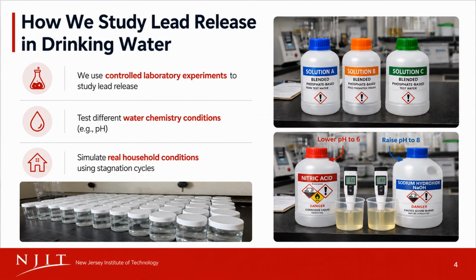In this study, we set up controlled lab experiments. We exposed lead pipe sections to water treated with three different blended phosphate chemicals. Then we tested each one at two pH levels, pH 6 and pH 8.